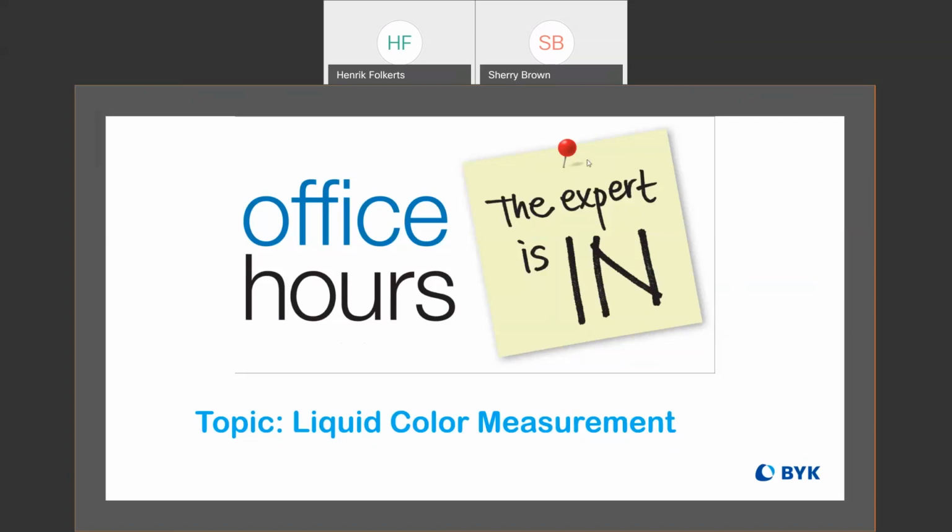Hey, Greg. Just an additional comment to that last answer from Corey. There are other cells available that go down to thinner path lengths. So a thinner path length cell combined with diluting the sample can give you a pretty large operating range for just about anything that you wanted to try to measure. It's just a matter of how much dilution you have to do and then correlating that to the end product. Good point.